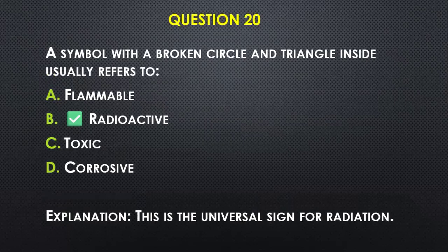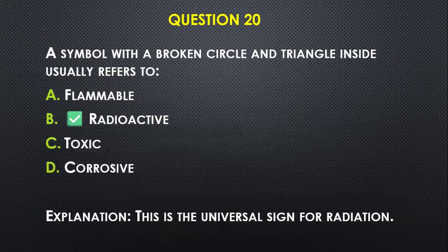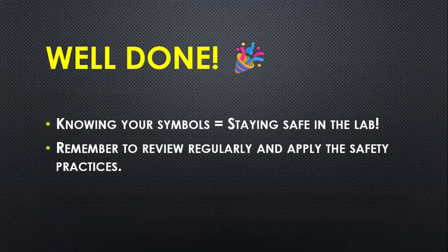Question number twenty: A symbol with a broken circle and a triangle inside usually refers to — A) flammable, B) radioactive, C) toxic, D) corrosive. That particular symbol is called the trefoil symbol and is the universal sign for radiation.